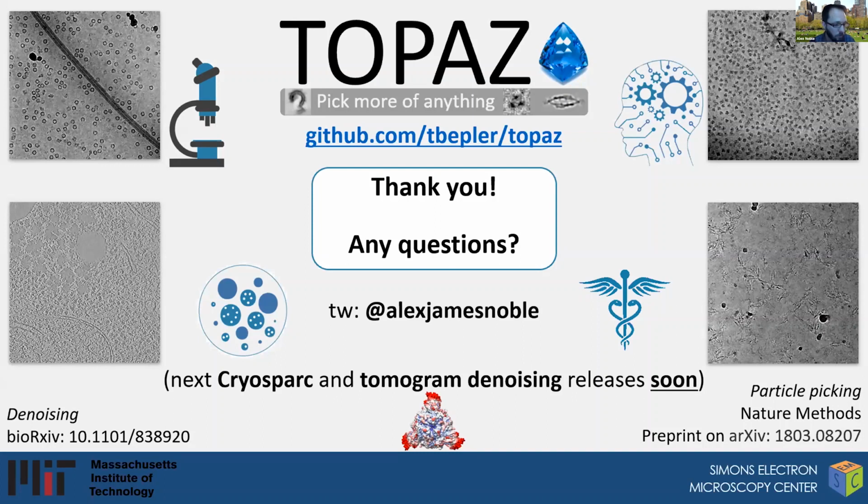And what we've found is that Topaz trains the best when you make the training radius of where your particle picks are, where you're telling it they are, somewhere between 1 and 3 pixels. So you want to only train on very small pieces of your proteins, and that makes it very robust to small sized particles, we believe. We haven't seen a limit. Okay, thank you.